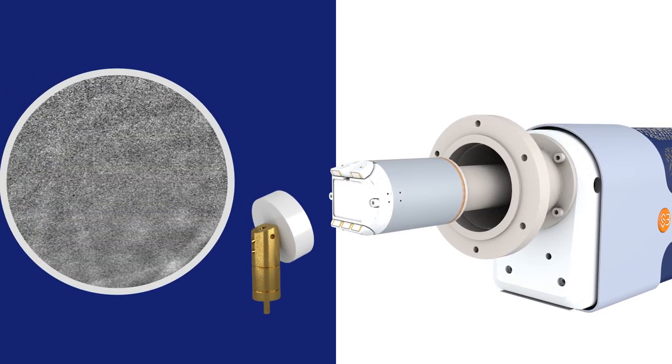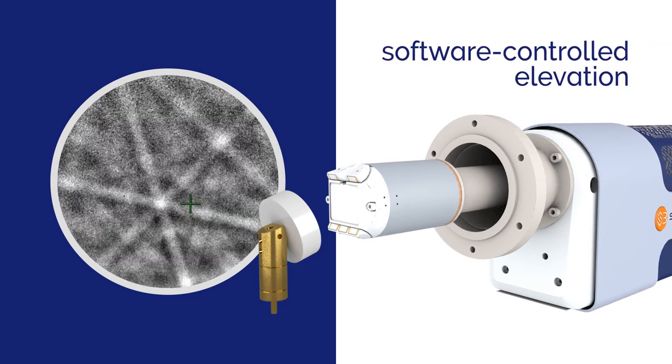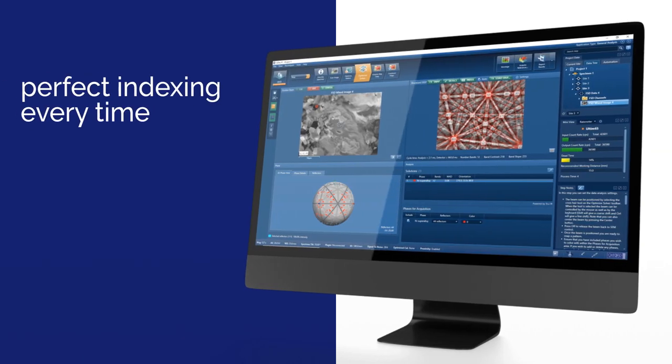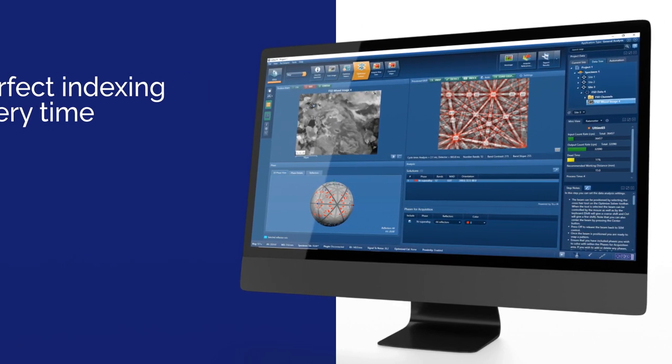Any sample size can be analyzed using Symmetry S3. Its unique software-controlled elevation enables rapid geometry optimization for any sample type. Aztec's automated calibration routines ensure perfect indexing at any detector or sample geometry, every time.